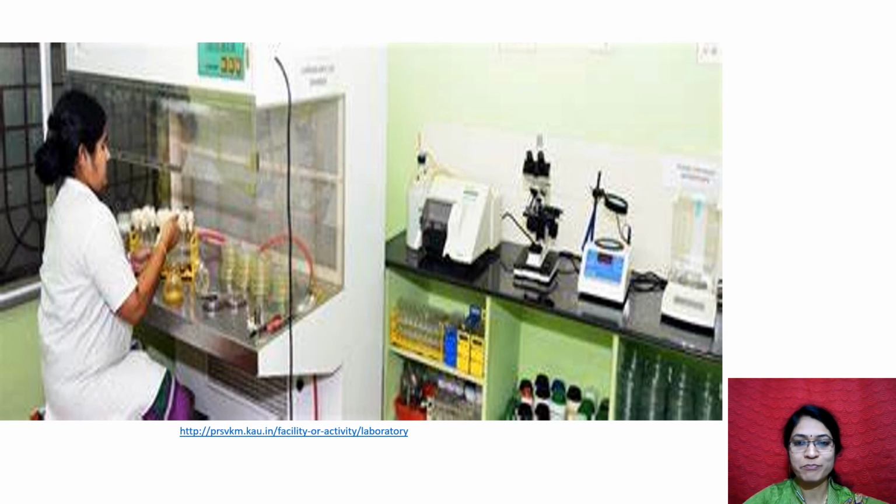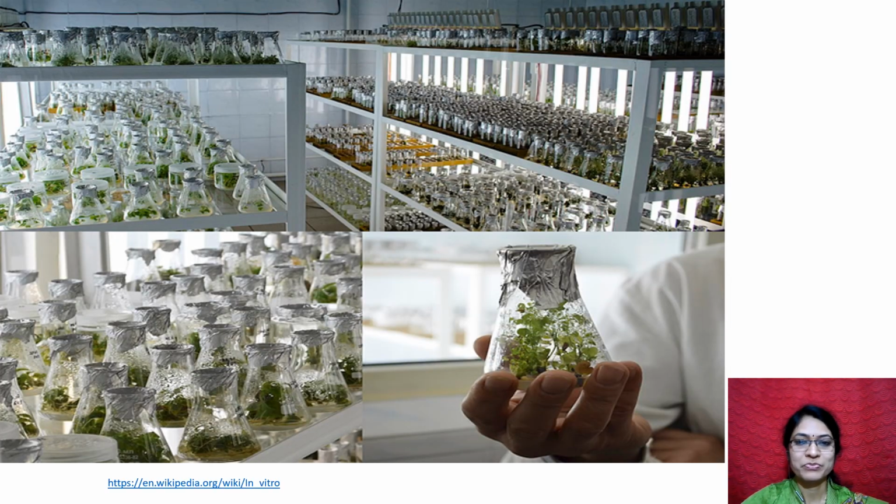Here are some pictures. You can see this is laminar airflow, and she is working with some of the culture tubes. This is the laboratory or transfer area. This is the plant tissue culture laboratory. Here many racks are there.